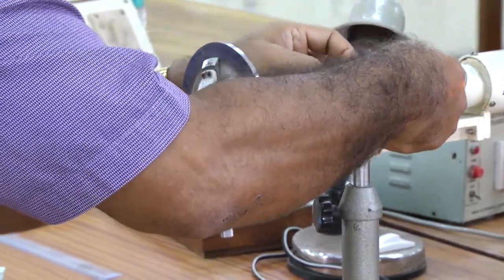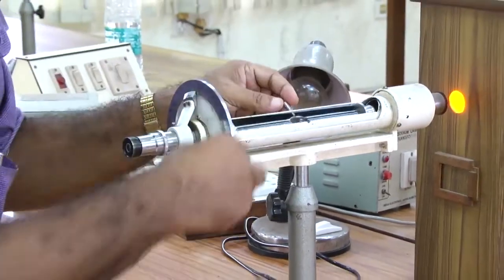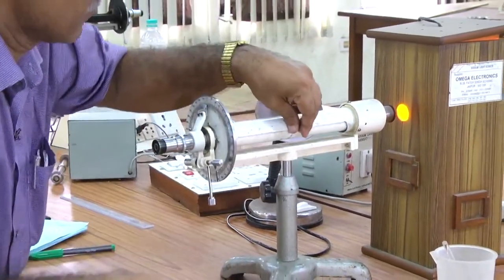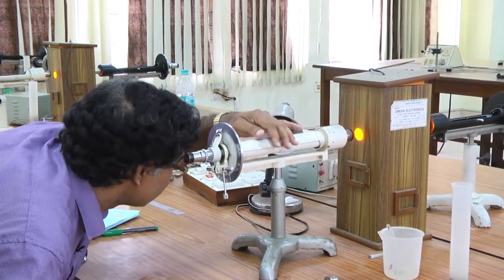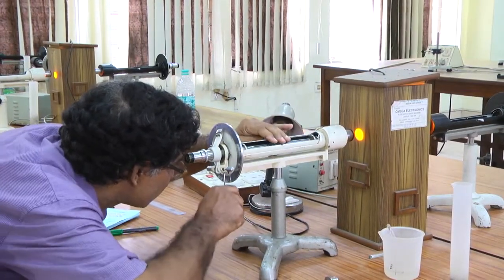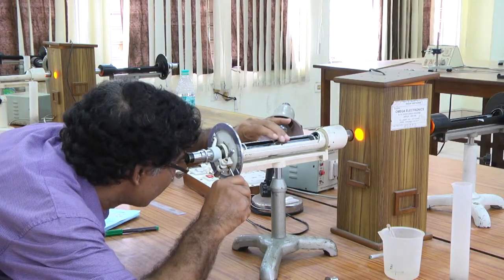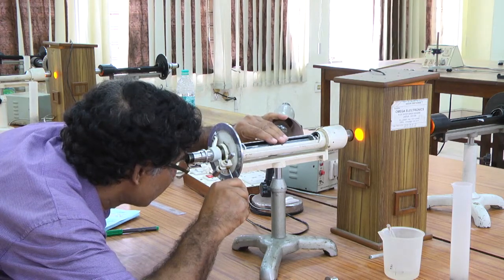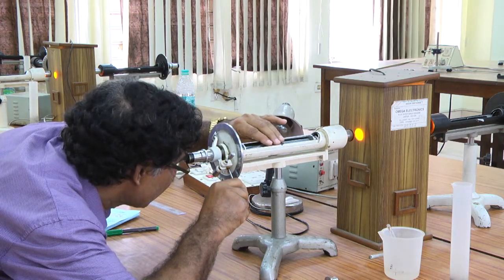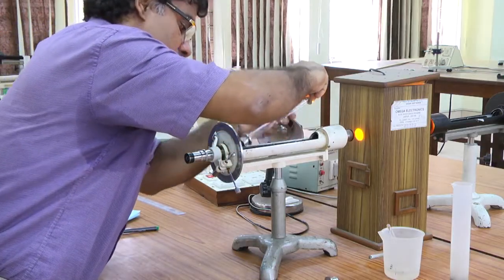I cannot see. So, I think this is the position to put. Yes, now I can see, but no, no. I have to put it properly. So, I am not able to.